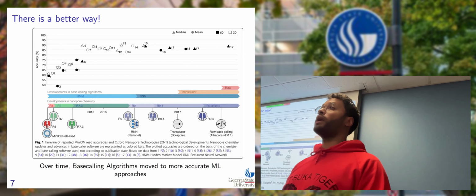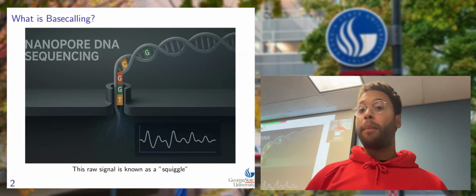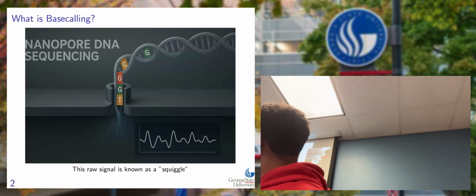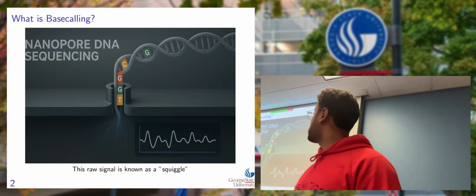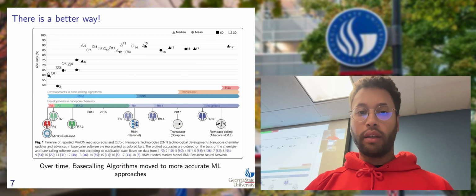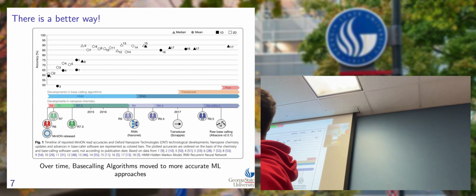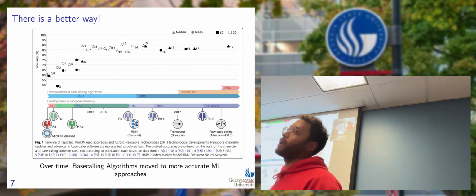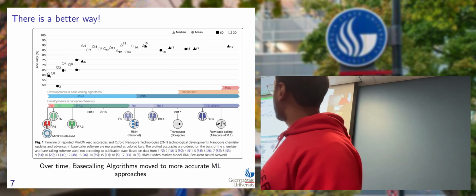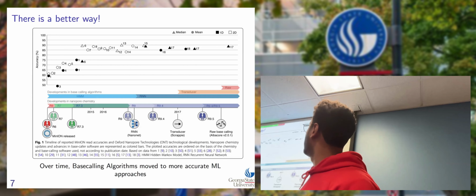What does that mean? Well, we have 1D strands and we have 2D strands, right? If we go back to the start, we can see that this would be considered a 2D sequence, because we have both strands passing through. Traditionally, with a hidden Markov model, if you have a single strand, you have much less accuracy. But for the 2D, you can see that we do have accuracy. Okay, it works well, good.